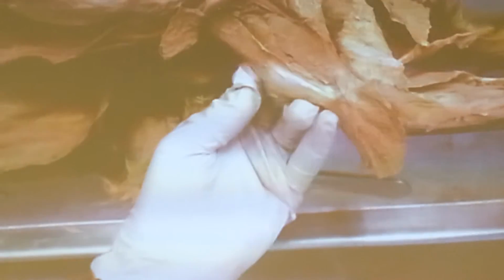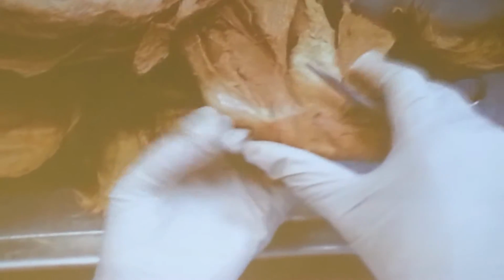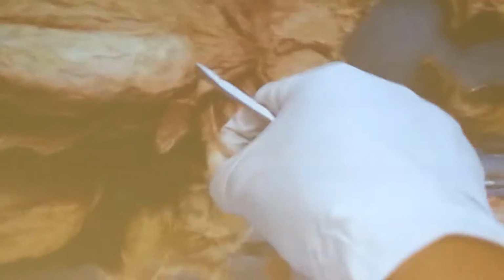And then, if you continue, you can see that a muscle is located between the two layers of the fascia lata. You can see that? What is that muscle called? Tensor fascia lata. You can see the border of the muscle here. If you come close, you will see. Later, you can come and see the cat here. This is the border of the muscle, so this one is tensor fascia lata.